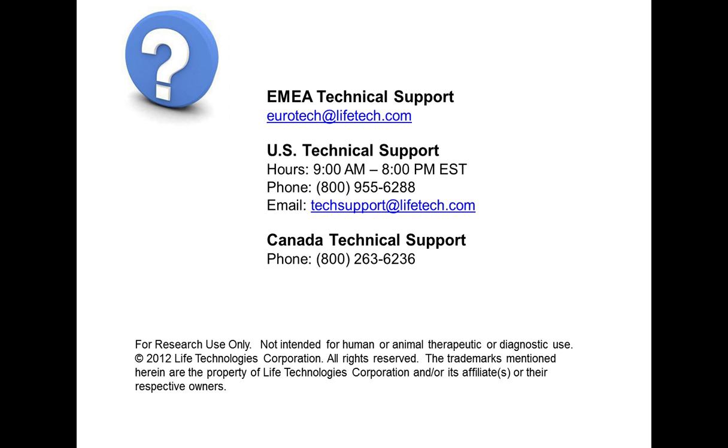So there's a question about a cell cycle and looking at S phase and whether you should gate cells or analyze it without gating. And there's a couple of schools of thought on this. If you are using a secondary program that is using probability, I would suggest that you don't need to gate for your analysis, and you can allow the software program to do that for you.